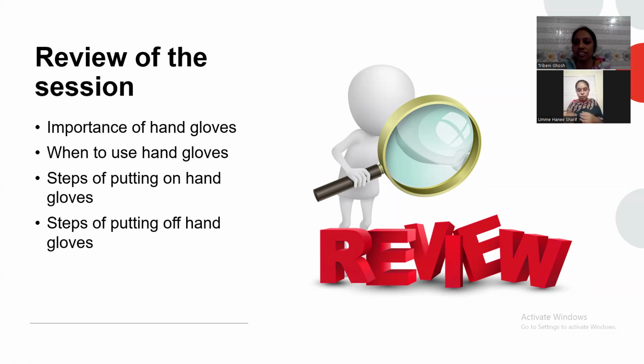It is not just for collecting samples, but also handling other stuff like equipment, and it's very important. I have also learned how to properly put on and doff. The term doffing I have just learned. I think this session was actually a lot more important than I thought it was going to be.